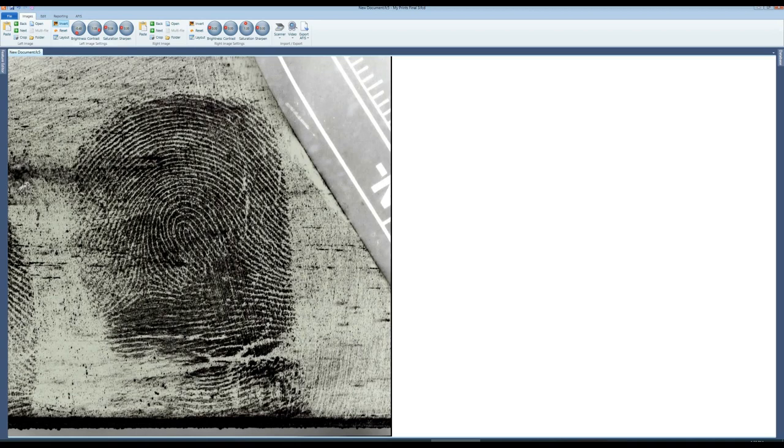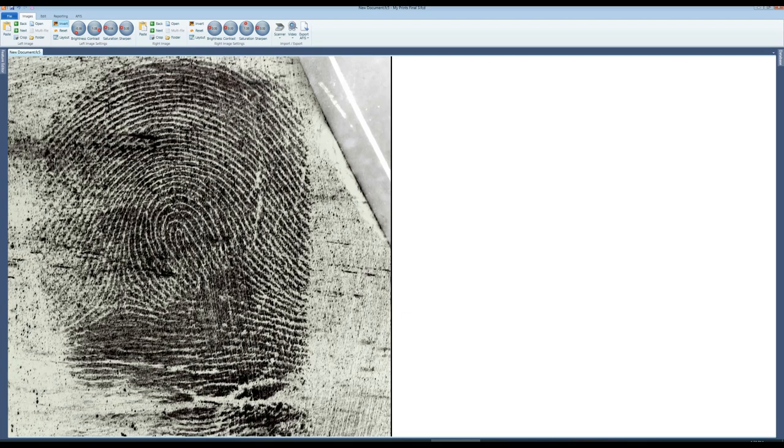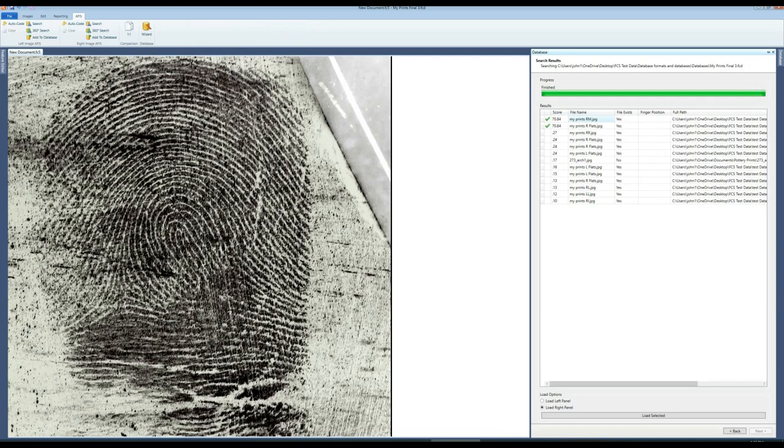When satisfied select APHIS to search the database. Results appear in the tab to the right of the screen. Select the first candidate to view.